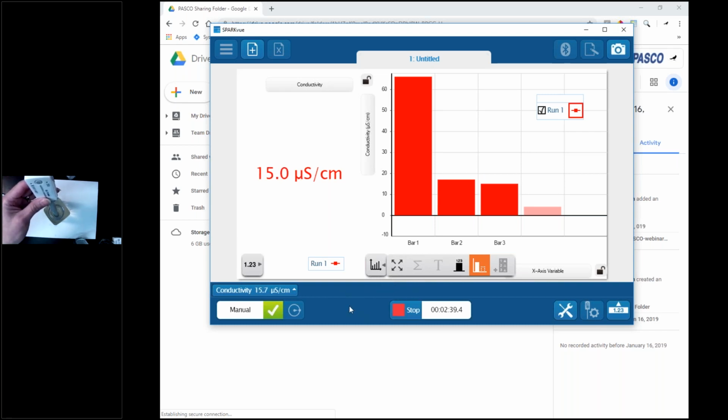It's a little lower, and a little lower. So to me, that's such a small difference that it's about the same. So I hadn't seen this result before. I came in, I was curious to see what would happen, and it's about the same. It's a little lower, and I would assume if I continue to see this trend of a little lower every day, if it rains tomorrow and I collect another sample, and it's lower again, then maybe it's just getting more dilute and I really don't have ions dissolving from the soil into the water after all.